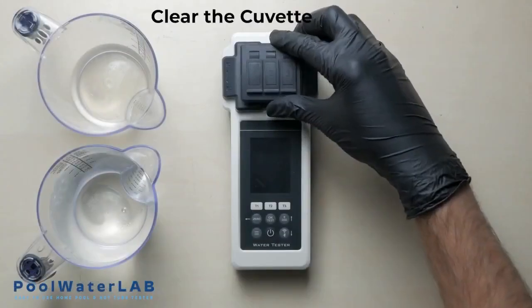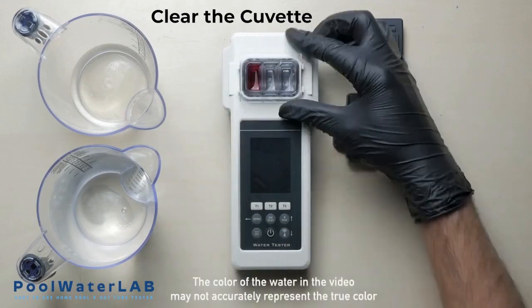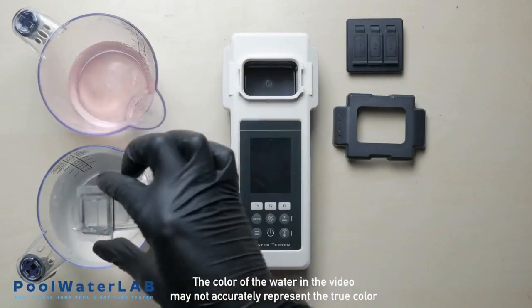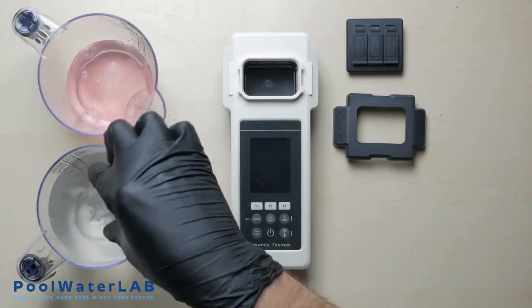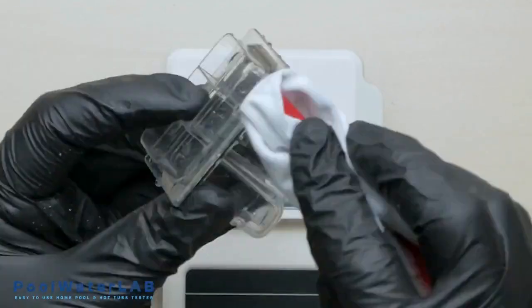Run another test if necessary. After completing the test, obligatorily rinse the cuvette with clean water and prepare your tester for the next measurement. Wipe the cuvette dry with a clean cloth.